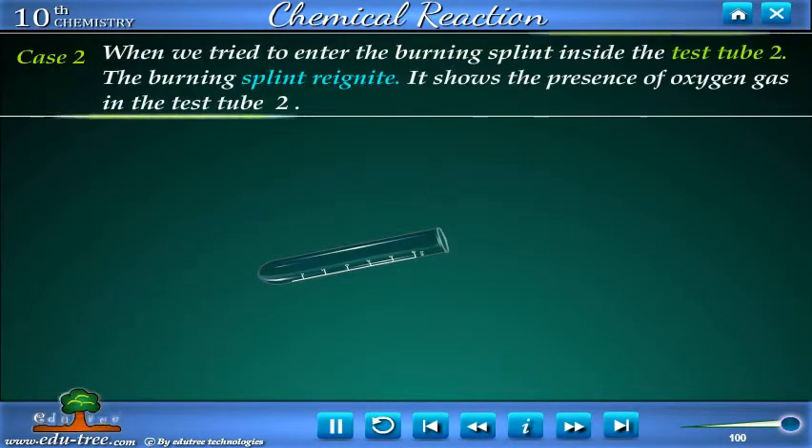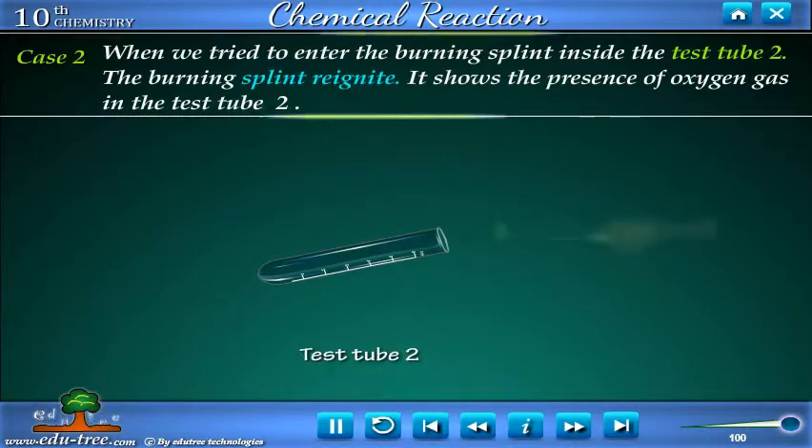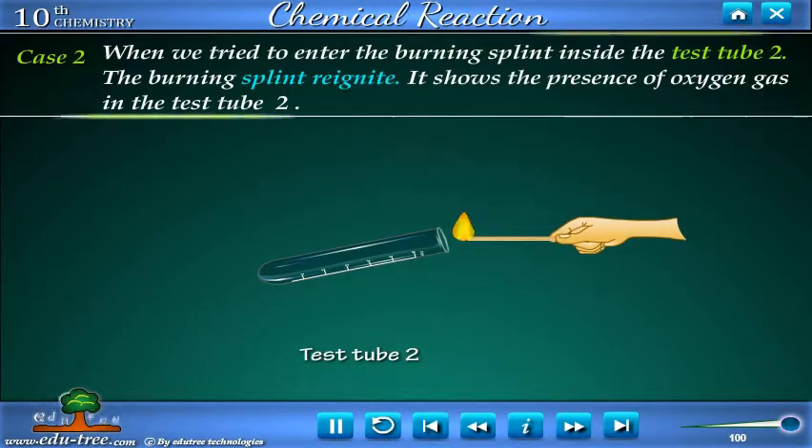Case 2: When we bring the burning splint near test tube 2, the burning splint reignites. This shows the presence of oxygen gas in test tube 2.